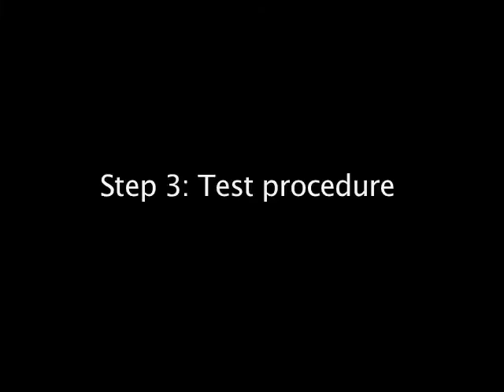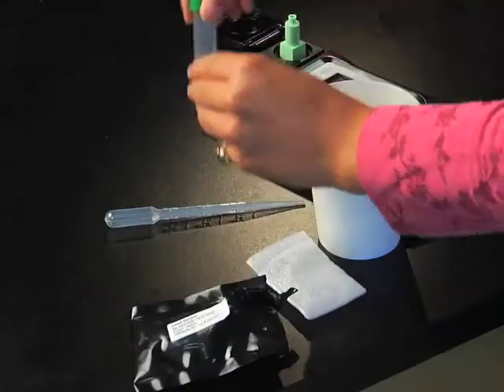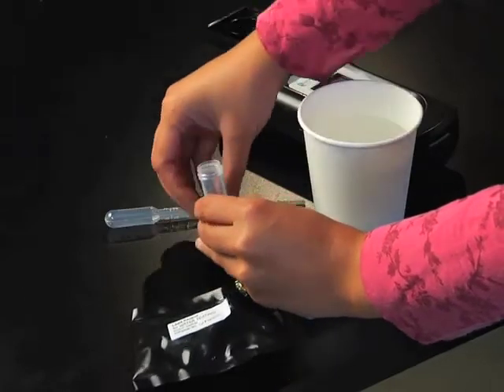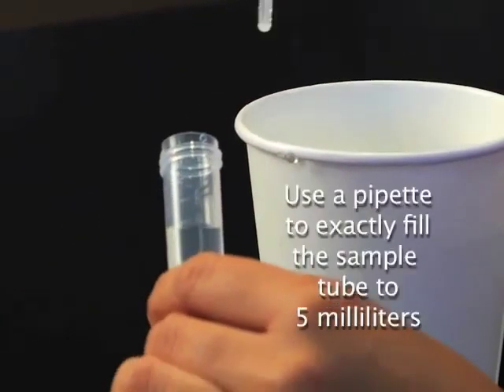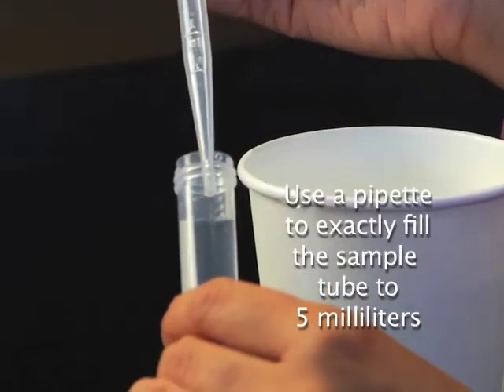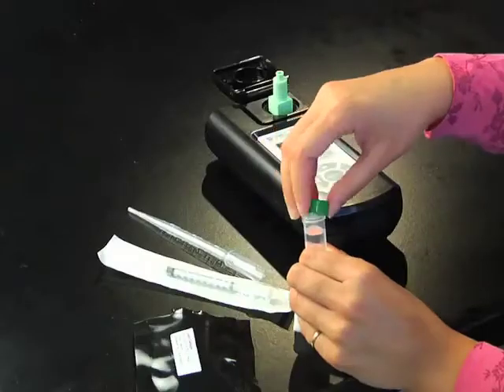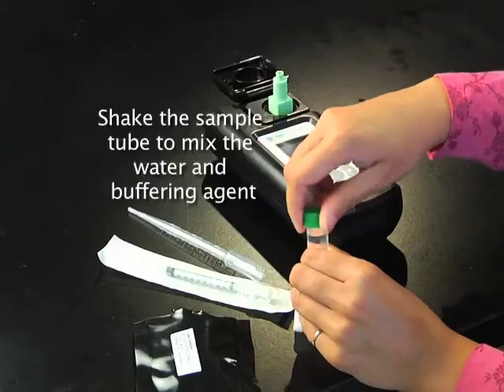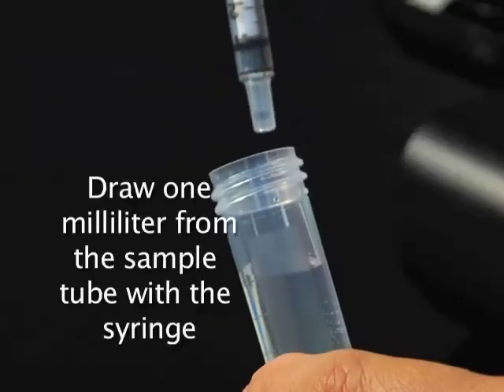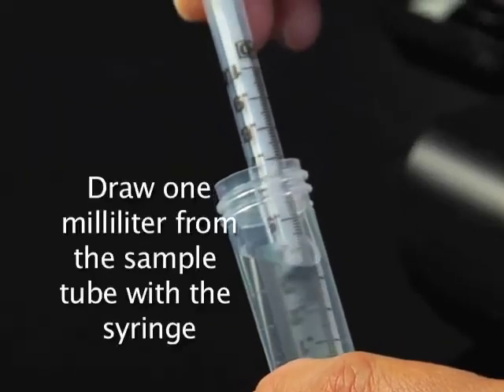Test procedure: Be careful to not spill the liquid buffering agent that is already in the sample tube. Use a pipette to exactly fill the sample tube to 5 milliliters. Shake the sample tube to mix the water and buffering agent for 15 seconds. Draw 1 milliliter from the sample tube with the syringe.